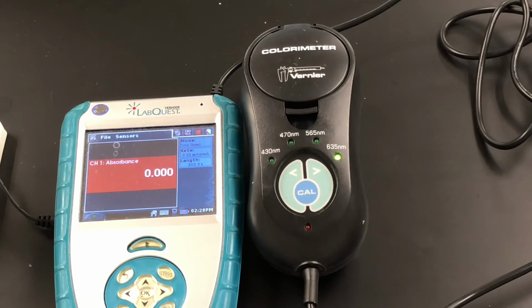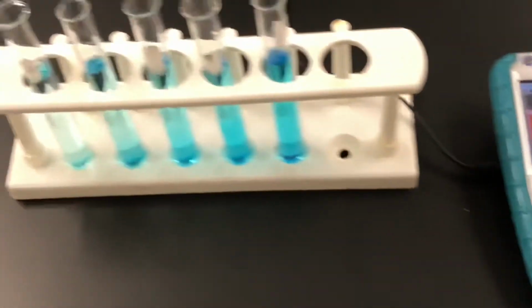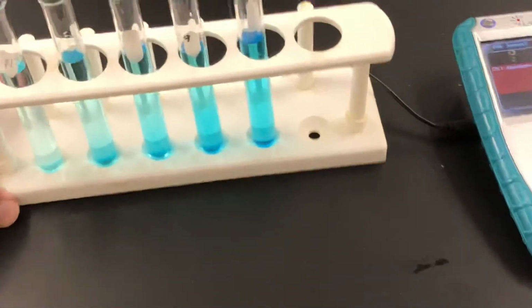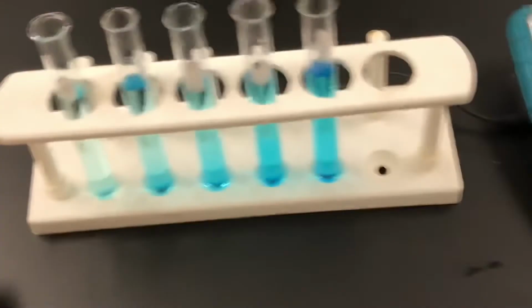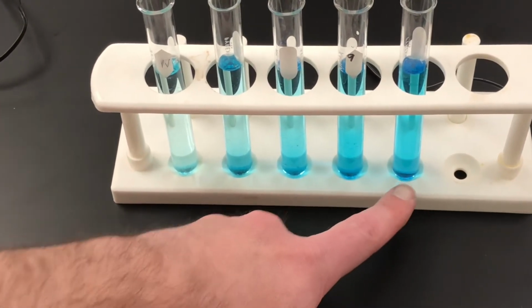And we start with 2 milliliters of the 0.4, and then we go to 4, and then we go to 6. So basically it's getting more and more concentrated. So if we look over here, you can see exactly that happening. When we're looking at our substance here, we can see that the color is getting darker.